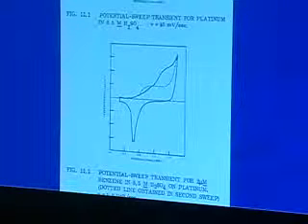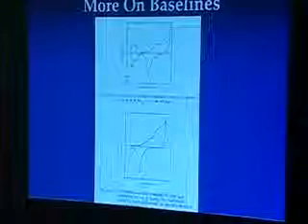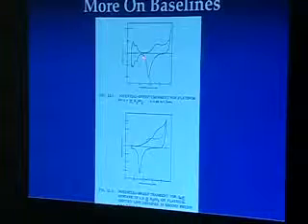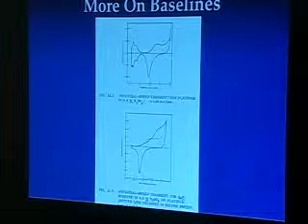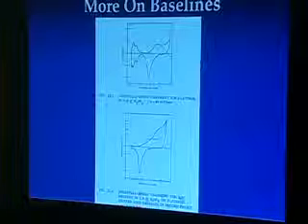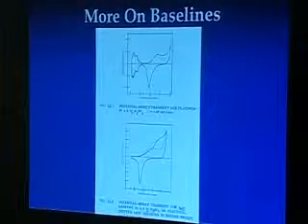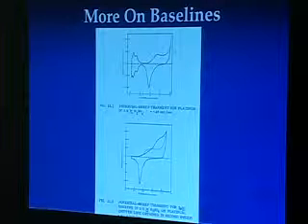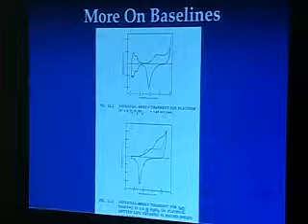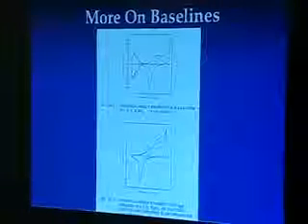So first of all, this pattern is very sensitive to having an impurity around, so it tells you you have a clean surface. And second of all, you have to be certain, even when you have the baseline for a clean surface, that the molecules you add aren't going and totally changing the nature of the surface. You at least want to know that that's happening. One way of doing this is to do a diagnostic that Nicholson and Shain did not talk about, and we haven't talked about, and that is look at a plot of peak current versus concentration.